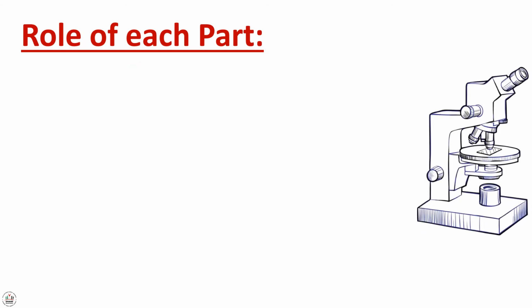Now, what is the role of each part of the microscope? Base, it holds all the parts of the microscope.